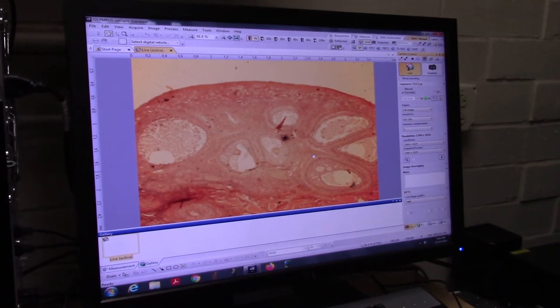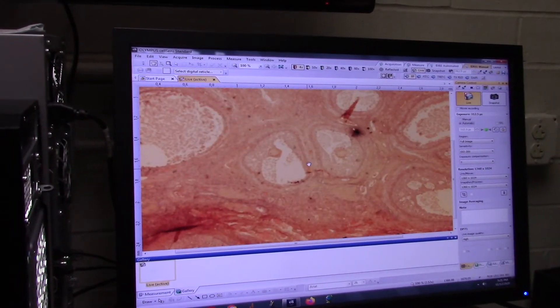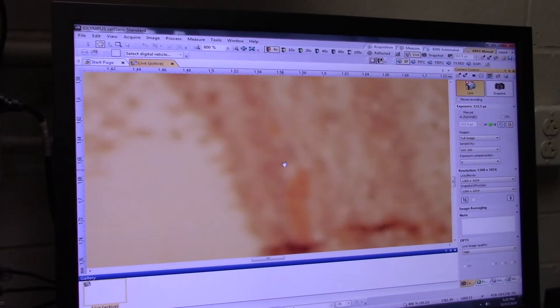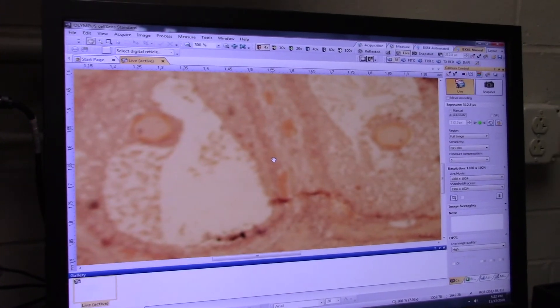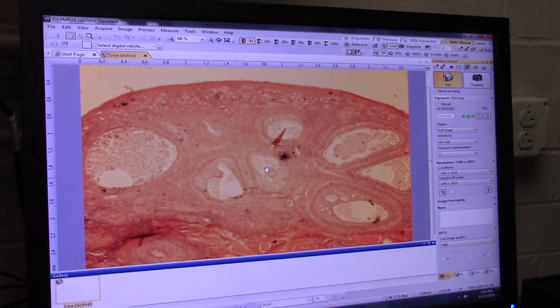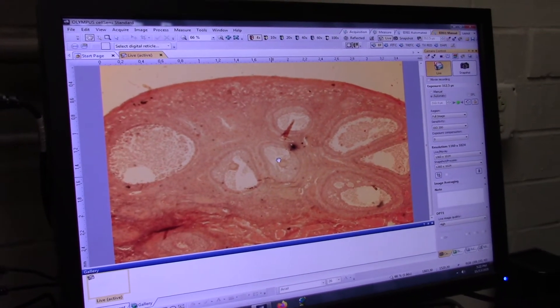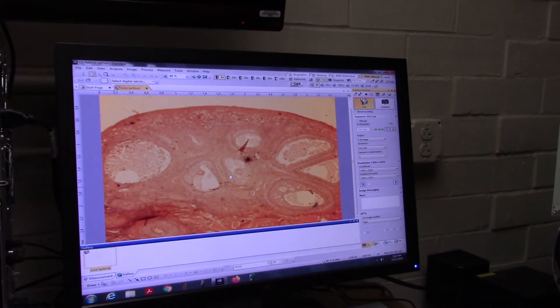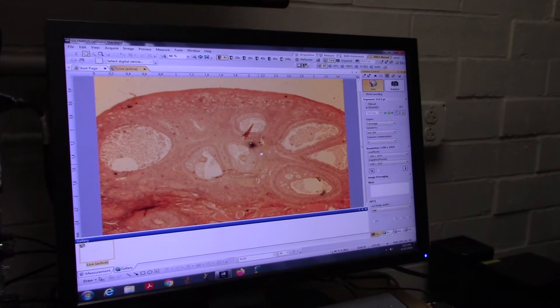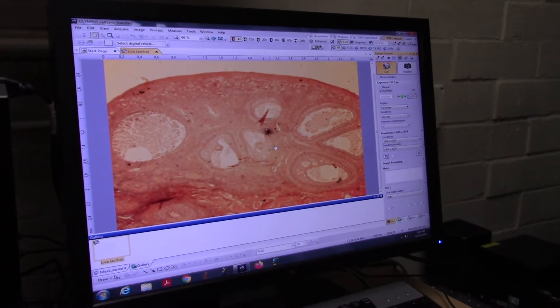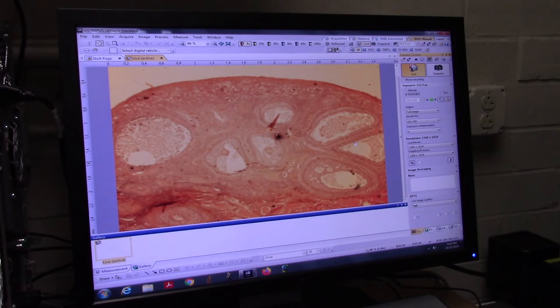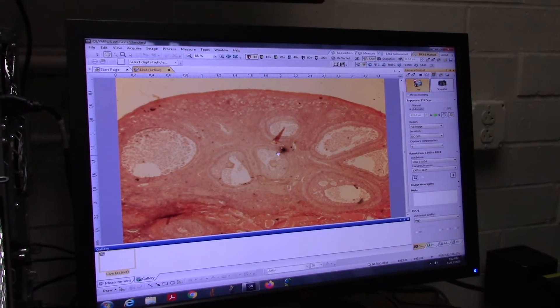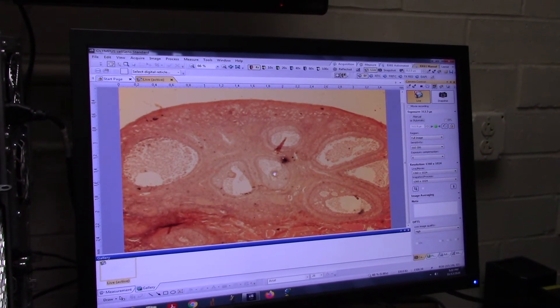I really can't see them that well. Since I'm using a computer, I'll use my scroll wheel and just zoom in. But you might want to stop zooming in — it starts to get super pixelated. The fact that we can zoom in using the digital camera, just like you do on your phone when you're taking pictures, gives us incredible power to focus in on what we want to learn about. So let's say these two cells are all I care about in this tissue section — I don't care about the larger follicles or the primary follicles, I just care about what's going on in these two cells.